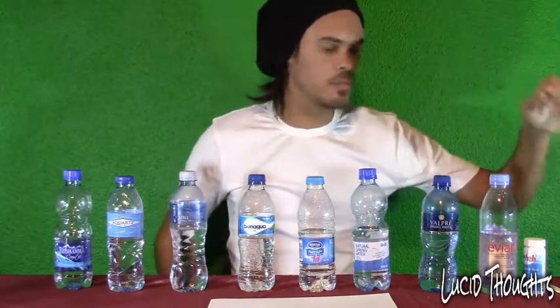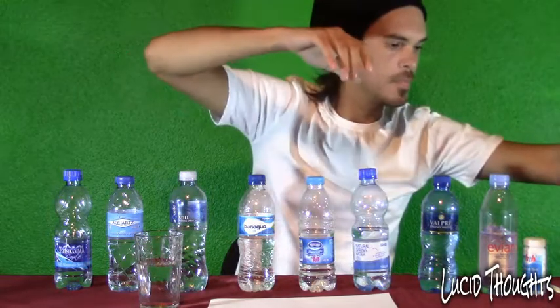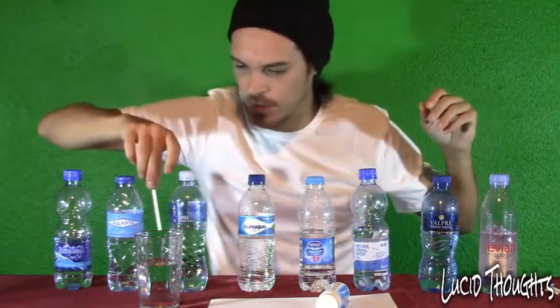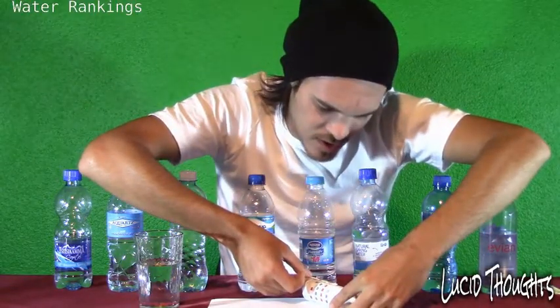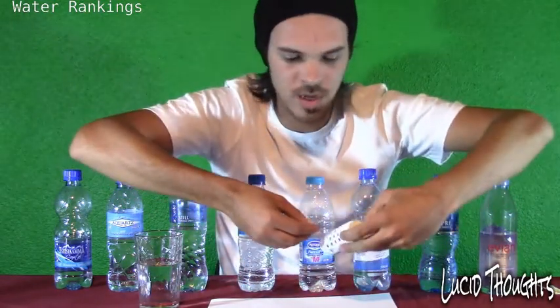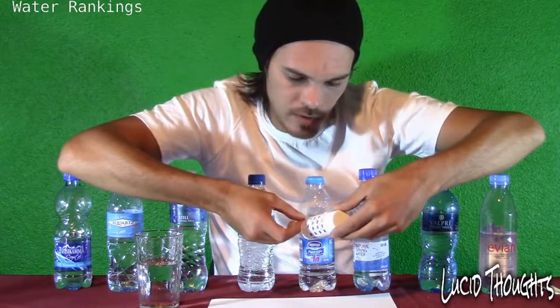Starting with the tap water. To do this correctly, keep the strip close on the white piece of paper, then do a very quick dip, keep it up for 15 seconds, and test it. Tap water: it's about 0.1 chlorine — brilliant. The pH level is about 7.3 — not bad. And the alkaline for tap water is about 20.